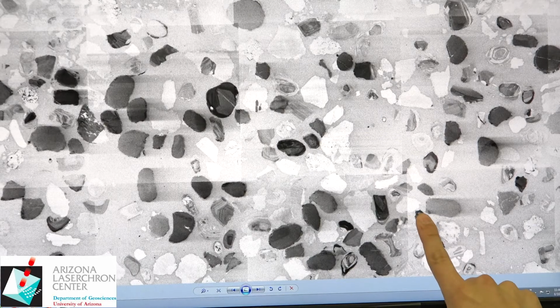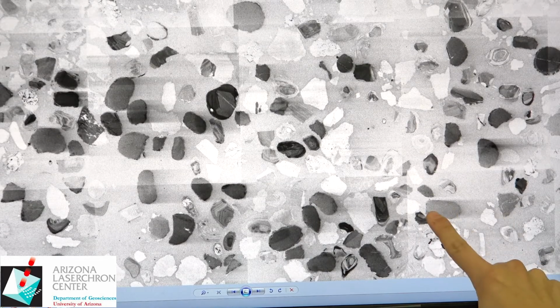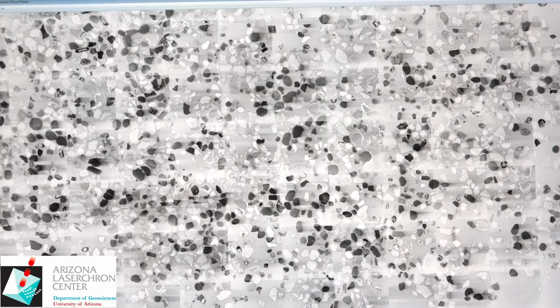All of those apatite pieces that we had seen earlier now are actually a bit easier to see. There are these darker, very homogeneous looking grains, and you can also see the streaking of that phosphorus signal from the electron beam in the SEM on this image as well. This will be the picture that we print off and give you in your paper map copies.